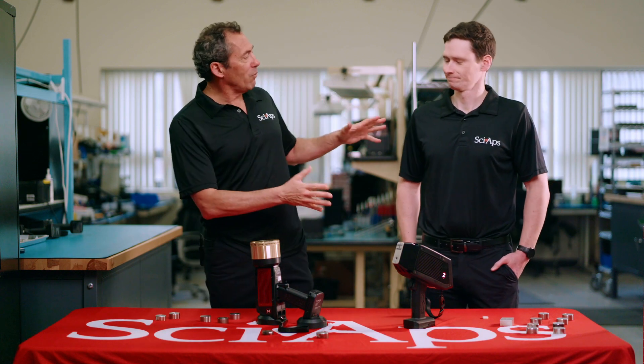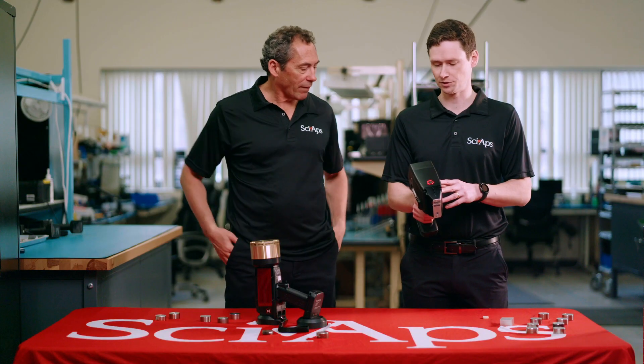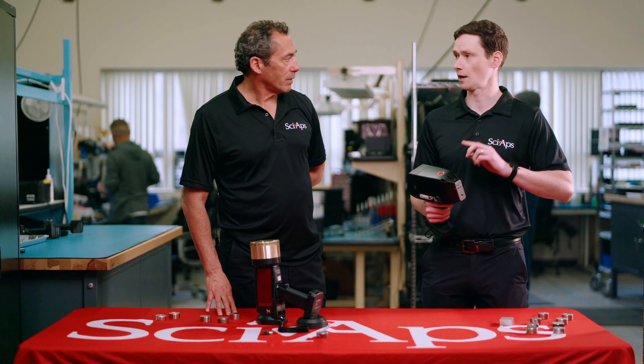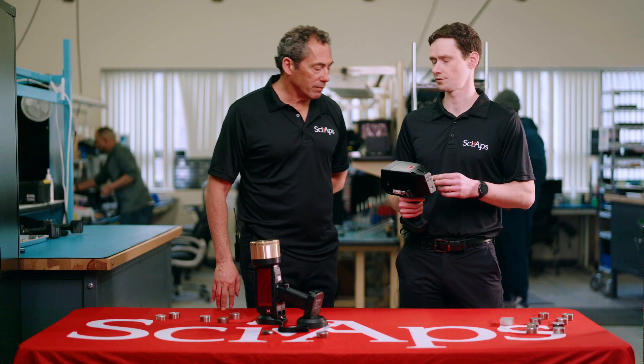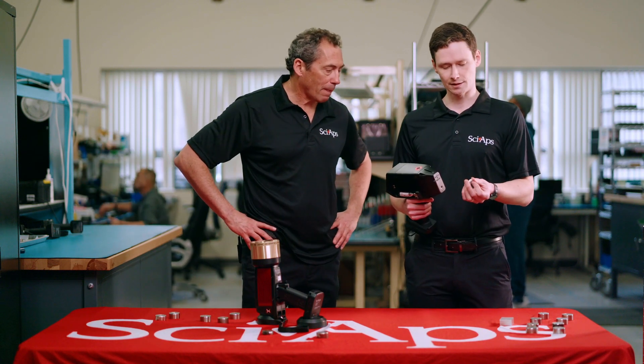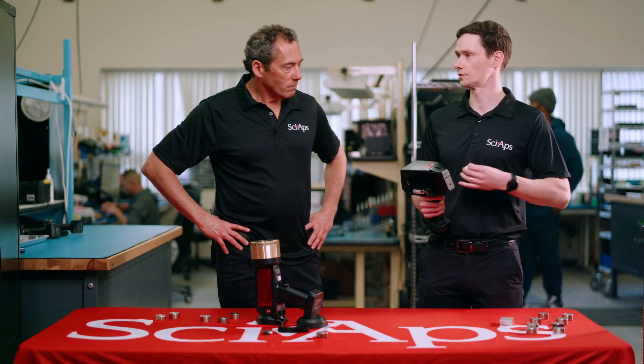So Morgan, take it away with the LIBS unit. This is our Z903 set up for geochem analysis. Right now I've got a lithium rocks calibration on here, so let me give you a quick test by shooting a pressed pellet like this. You start with a powder that's nice and homogeneous so every time you shoot it you're shooting the same material. The pellet also gives you a nice hard surface for the laser to interact with, which is a little different than XRF where we can shoot loose powders.